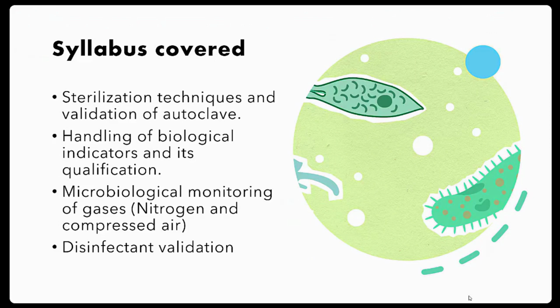Next, microbiological monitoring of gases. Nitrogen and compressed air will be used in the pharmaceutical industry. These will come directly in contact with the product. So the quality of nitrogen and compressed air will be monitored by total aerobic microbial count, and for nitrogen, total anaerobic microbial count. And next, disinfectant validation.